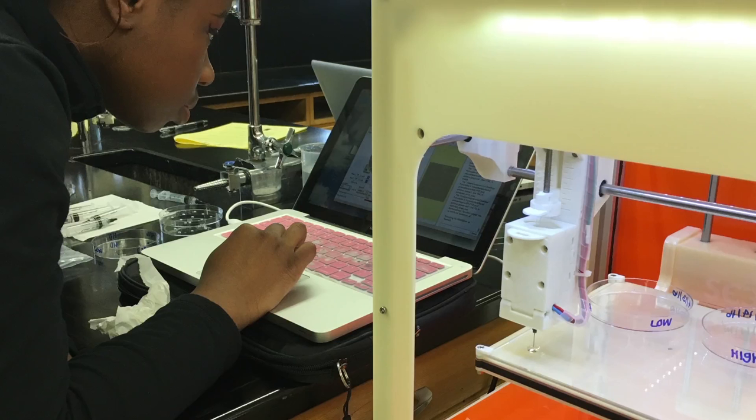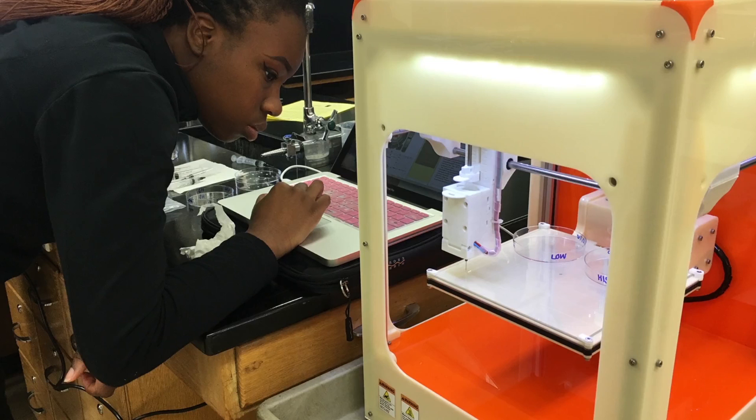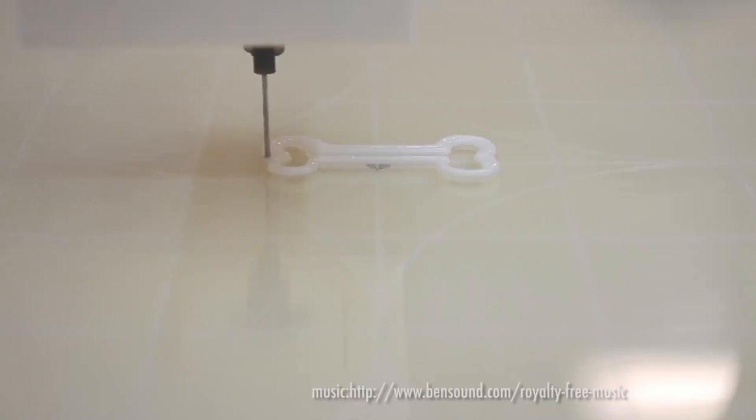Kids that maybe don't learn with words from a page will learn by using their hands. So the actual lab skills and techniques, the muscular coordination, will be very good for them to develop.